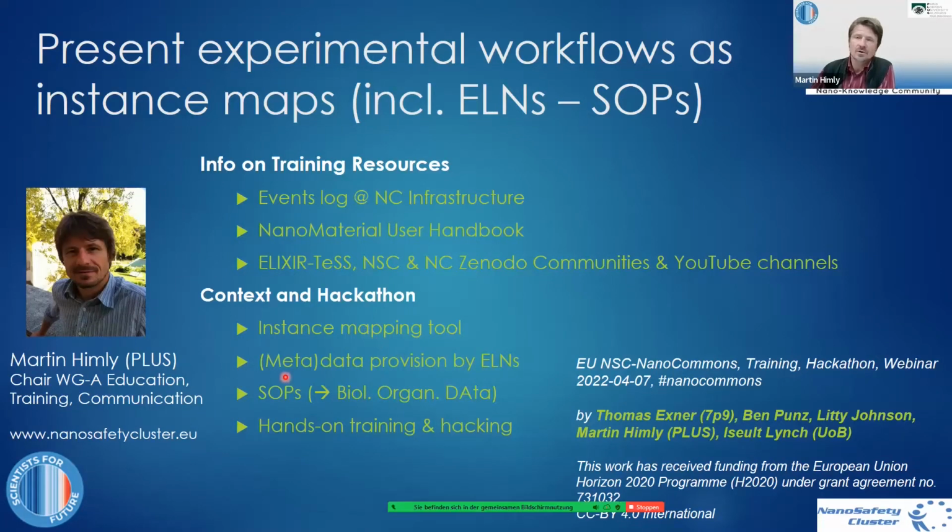Then we're also going to talk a bit about metadata provision, so this connection of the instance mapping tool to electronic laboratory notebooks. We then deal with standard operating procedures from our perspective of human hazard assessment, but there we would also like to invite the audience for interaction, because you are working in different workflows and in different fields and eventually have your domain-specific requirements for biological data provision.